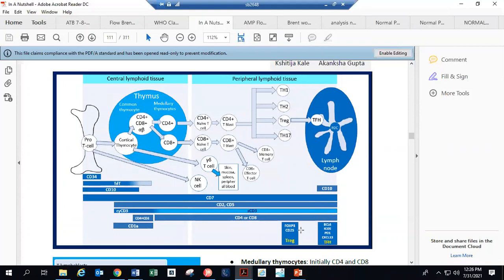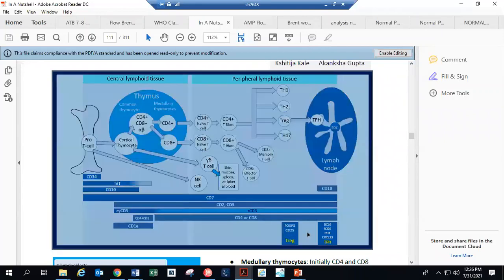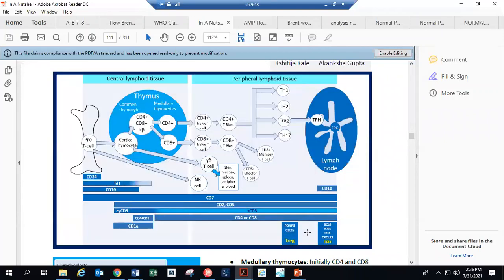Similarly, the T regulatory markers, CD25, FOXP3. Do you remember what tumor, or what lymphoma do we read CD25 in? CD25, I think, is CLL that sometimes has it, and FOXP3 is follicular, right? I don't know. Sorry, maybe I'm wrong.